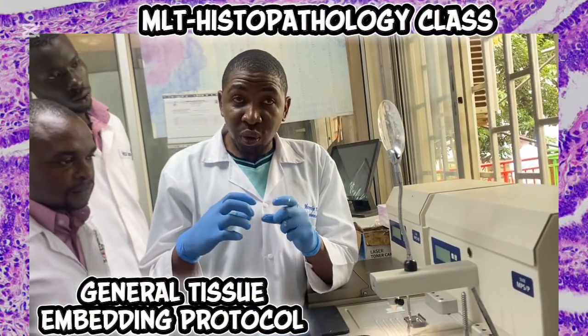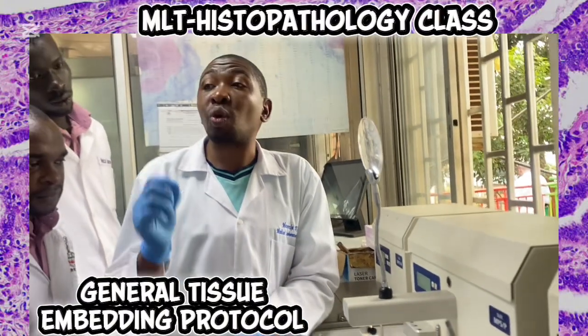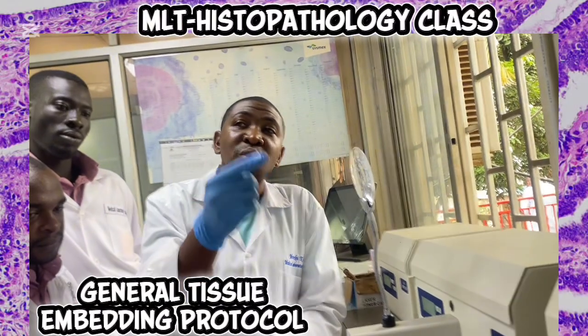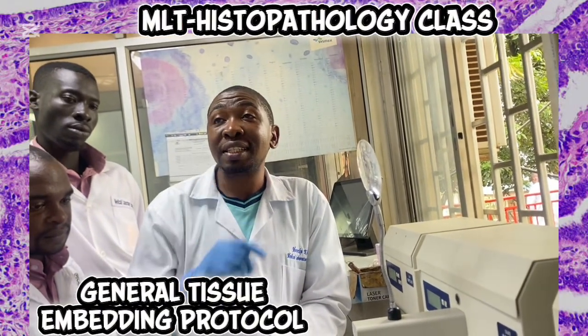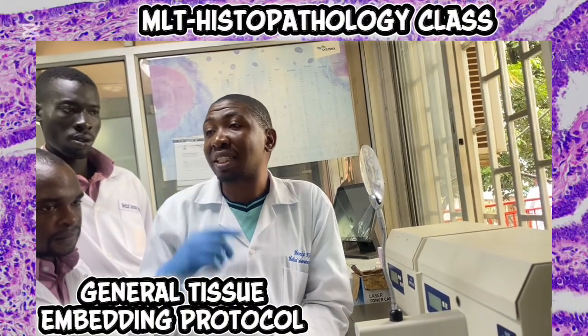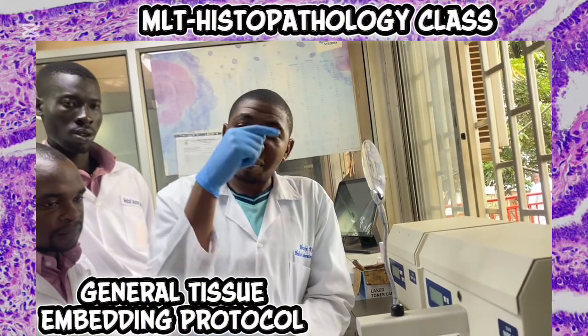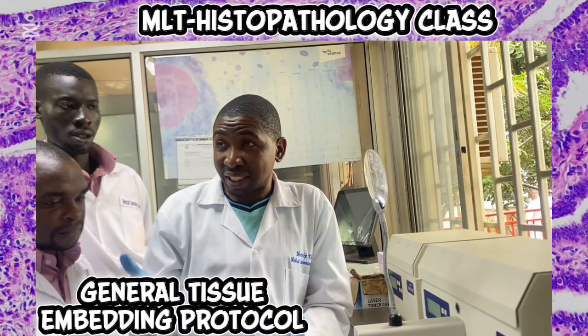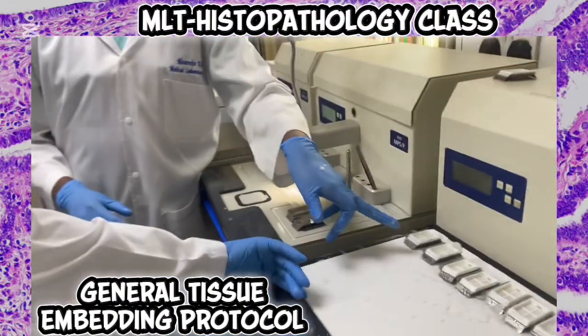Otherwise, if you form two layers, it is bound to cracking during microtomy. And that means you'll have to come back and re-embed the tissue. And just imagine it happens to 100 samples. You have to come back and re-embed. One, there is delay, patients getting the result.